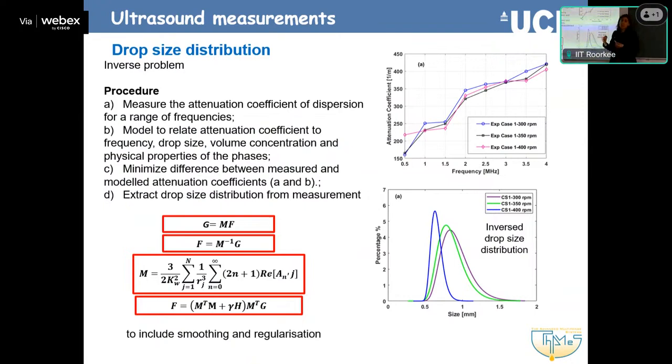The other thing we need to do is a little bit of trial and error. If you don't have any information about your system, you might need to try different frequencies because, as I said, to capture smaller particles you have to have higher frequencies. Smaller particles, higher frequencies, because these have the smallest wavelengths. So you might need to play around. If you can only have a certain frequency, then of course that limits the smallest particle you can reach.